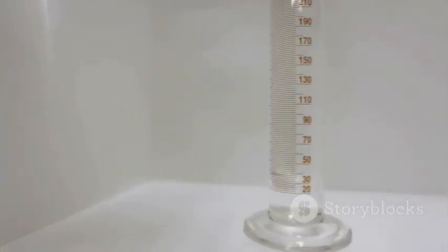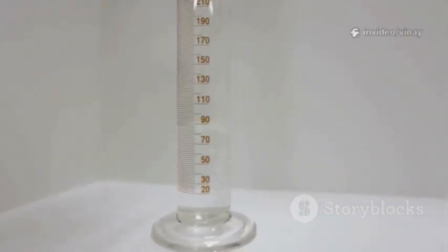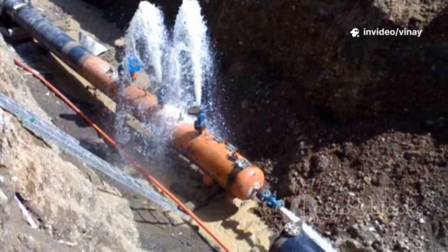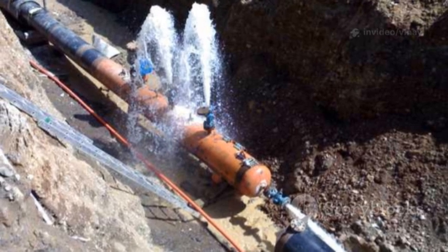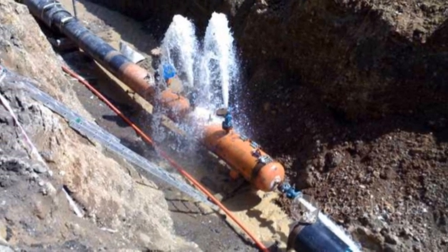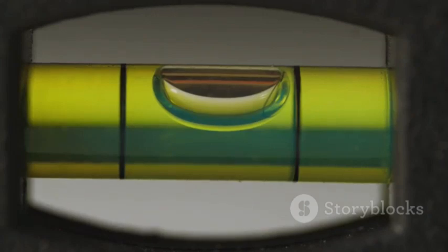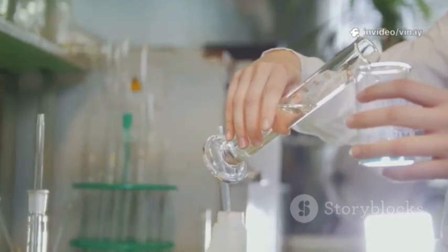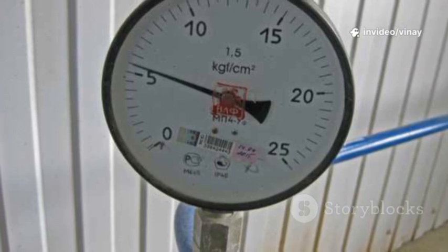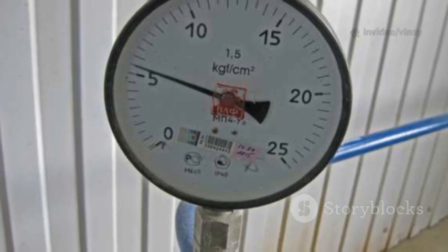Since we can't easily wet these filters with water to perform a bubble point or forward flow test, we need a different strategy. That's where the water intrusion test, or WIT, comes in. The water intrusion test cleverly flips the script. Instead of wetting the filter with a liquid and pushing gas through it, we keep the filter dry and push water against it. We apply water pressure to one side of the dry, hydrophobic filter membrane.